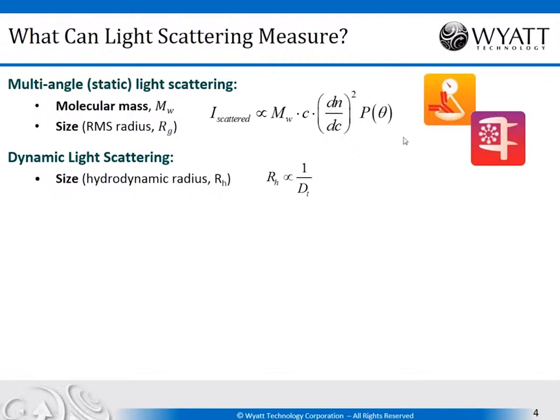And it does that using the equation shown here, simply by illuminating the solution with a laser beam and measuring the scattered light. We can determine the molecular weight if we know the concentration of the molecule and we know a quantity called dn/dc, that's the refractive increment, and that is a universal property of all unadulterated proteins. Once you apply some post-translational modifications, it might require some changes, but for standard proteins that's a universal number, and so simply by measuring concentration and scatter intensity we can determine directly the molecular weight.